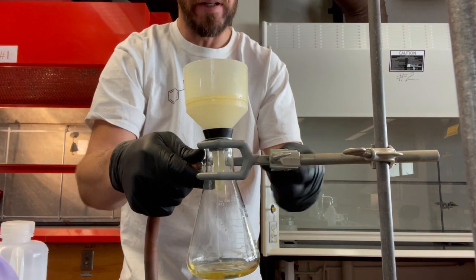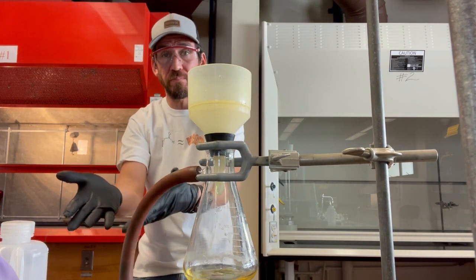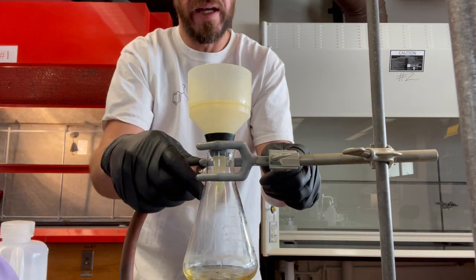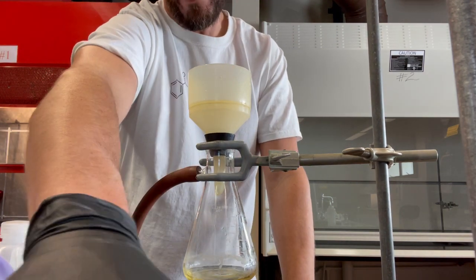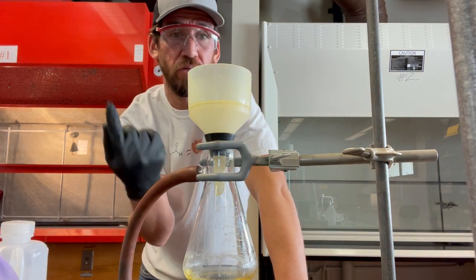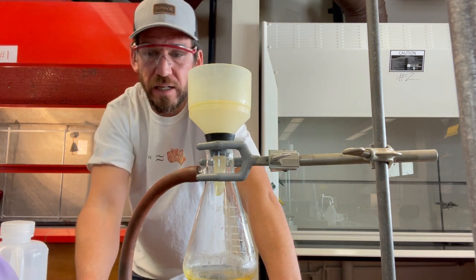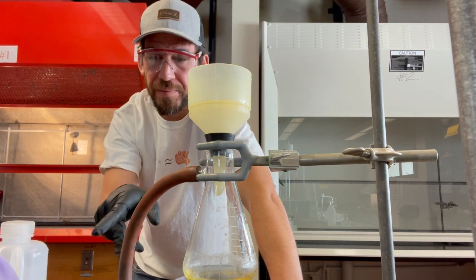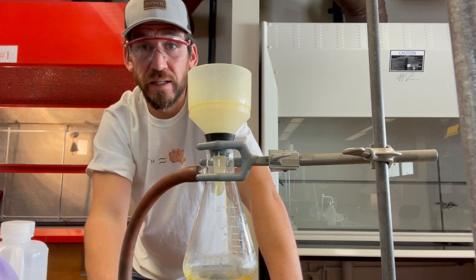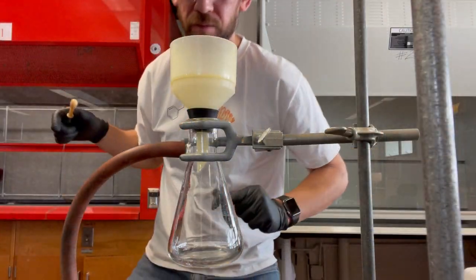All right, so now I don't want acetone to be in my ethanol either, so I'm going to turn this vacuum off, throw the acetone away in the proper waste container, and then rinse with a little bit of water and be done with it. Then I'll be back with you in a second with the filtration of the ethanol solution, okay?